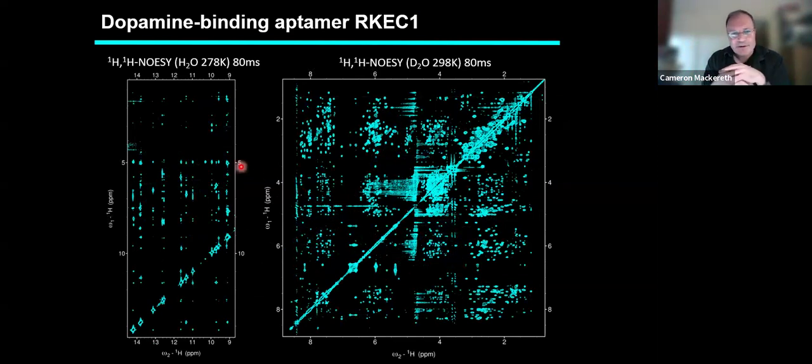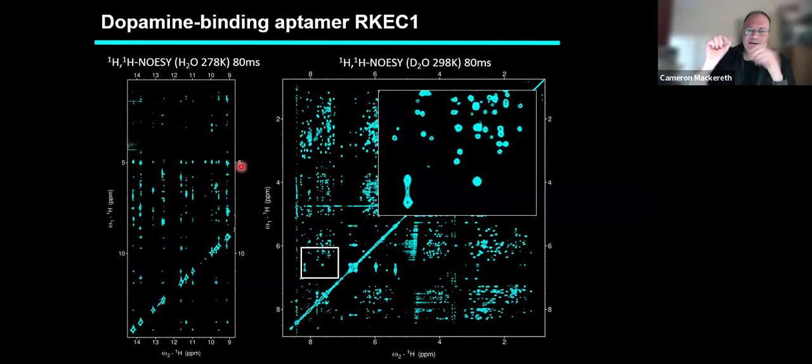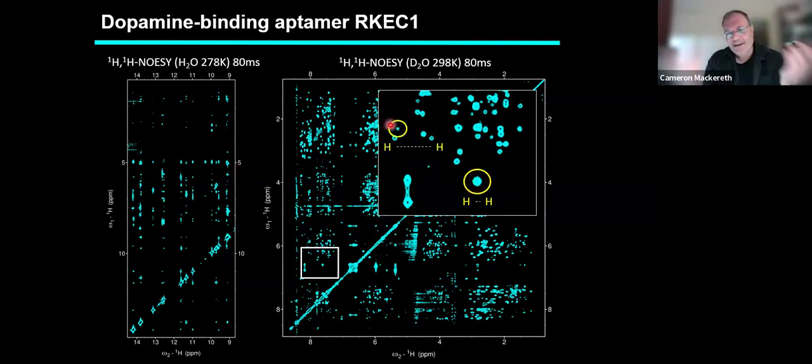And then we did a type of experiment called a NOESY. And so if you've never heard of this before, it's an NMR technique we use to generate structures, because what it allows us to do is determine distances between pairs of hydrogen. And the closer the two hydrogens are, the more intense or larger the signal is. And if they're further away, it's less intense. And you can actually calibrate this and also give identities. So you'd know that, for example, this hydrogen is maybe on T12 and this hydrogen is G34. And you know that there are a certain range of distances apart.